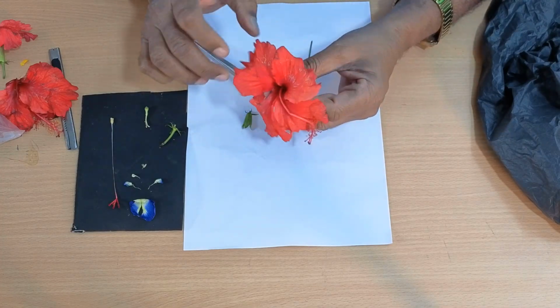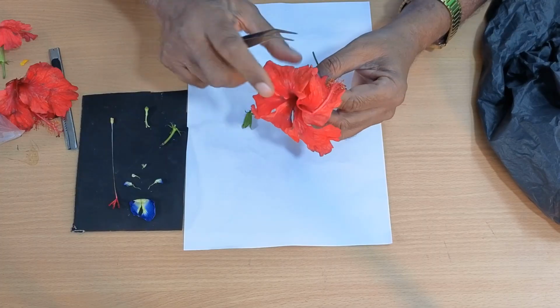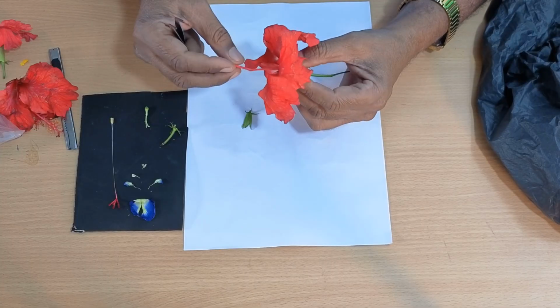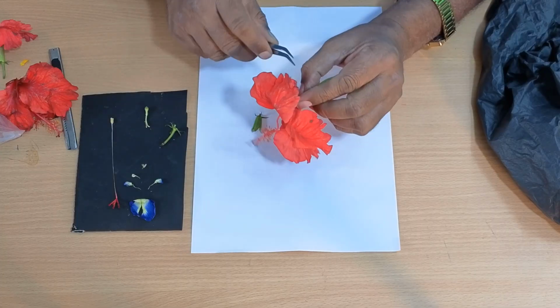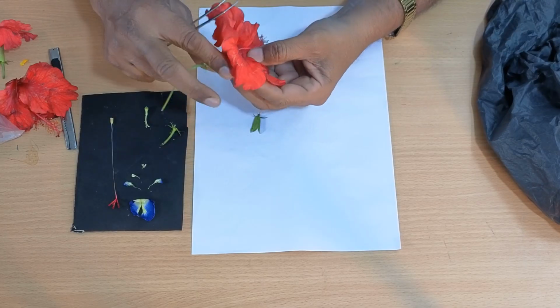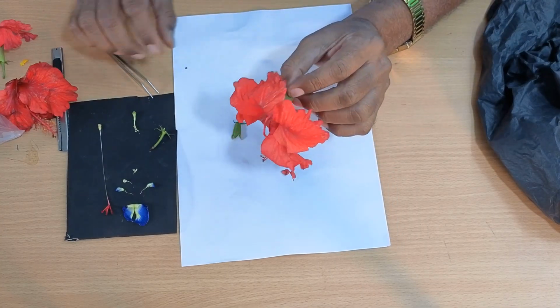The corolla has 5 petals, and they are fused below with the stamens, so it is epipetalous, and this shows a twisted aestivation. You can see very well here. It is something like playing cards, one rolled over the other. So this is called twisted aestivation.